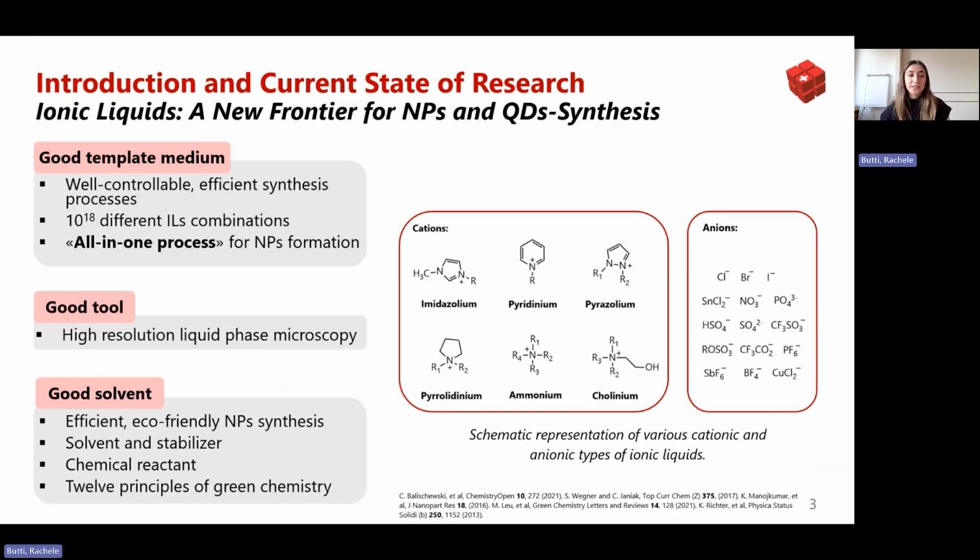Moreover, they also represent a good tool for high-resolution liquid phase microscopy, since due to their low vapor pressure, they survive the high vacuum of the microscope. And they are good solvents, eco-friendlier alternatives to volatile organic or commercially available solvents.